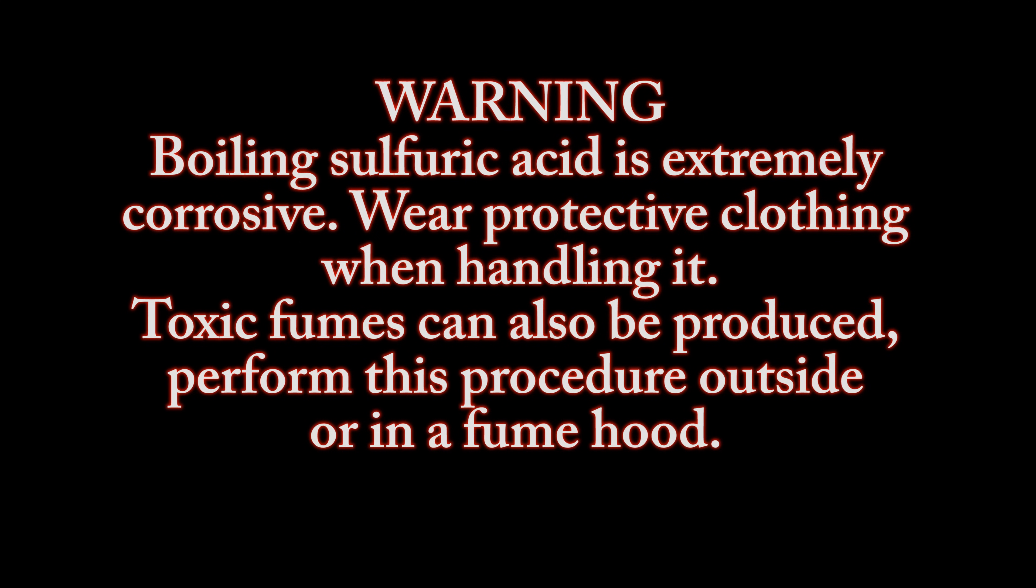Warning. Boiling sulfuric acid is extremely corrosive. Wear protective clothing when handling it. Toxic fumes can also be produced. Perform this procedure outside or in a fume hood.